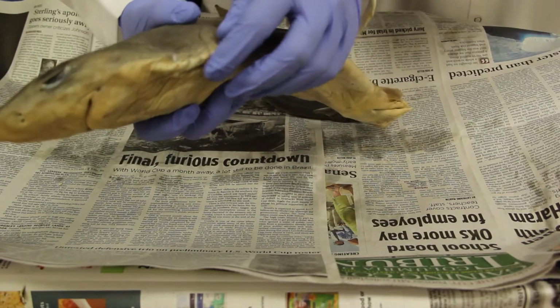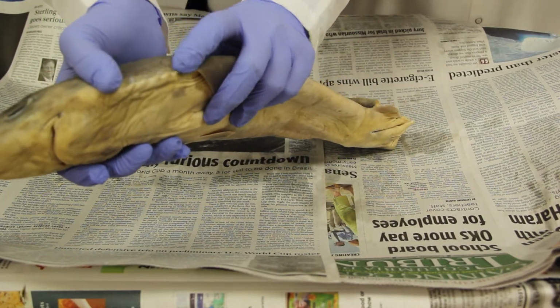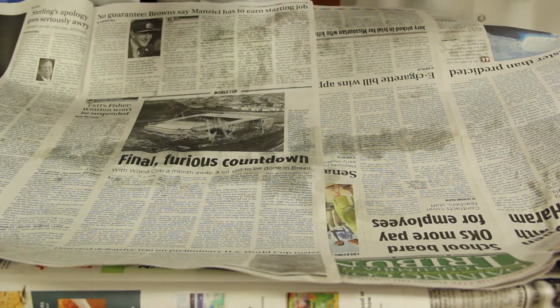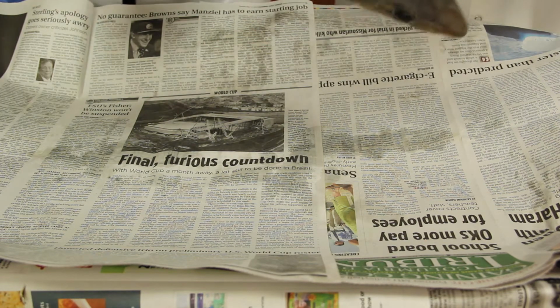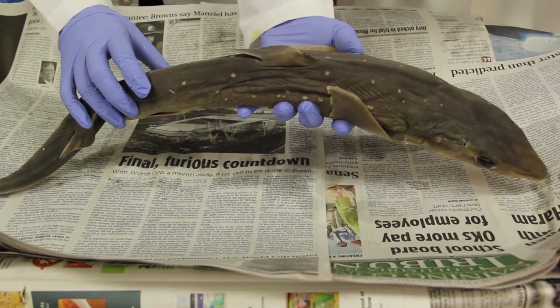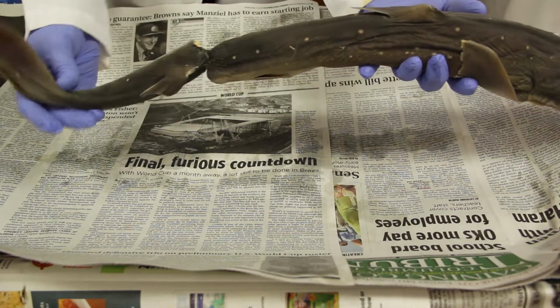These are the gill openings. And see, this is how it helps them breathe in the water, and you can also call them gill slits. Down here is the pelvic fin on the side, which also helps them with locomotion. And then this is the caudal fin. This is what helps them move when they're swimming.